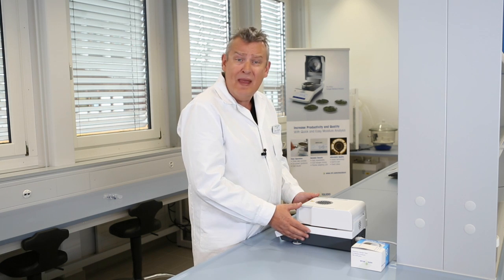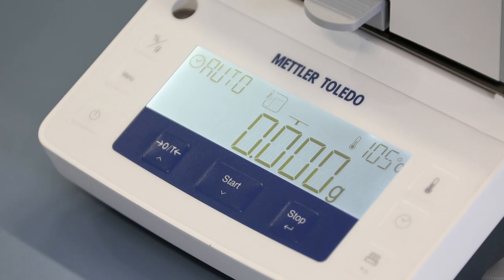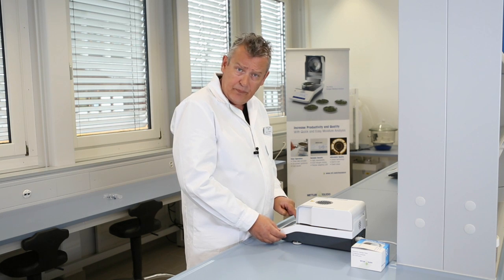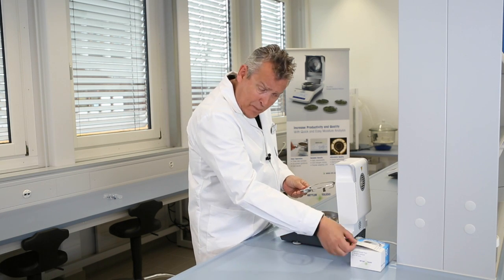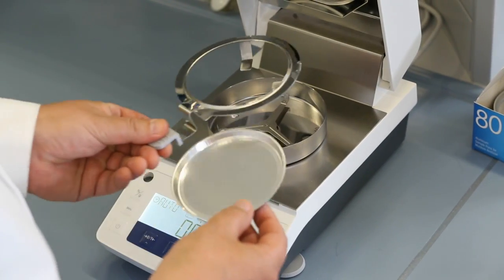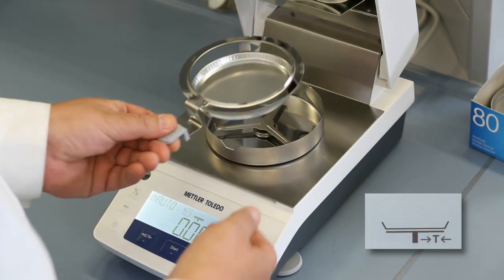Let's perform a measurement of potato crisps. Take a look at the icons on the display which guide you through the drying process. First of all, we need to place the aluminium sample pan in the pan handler, place the pan on the weighing pan, and then close the lid.